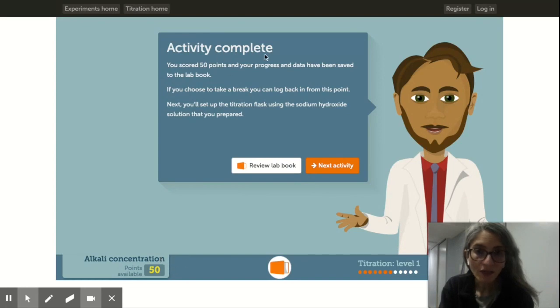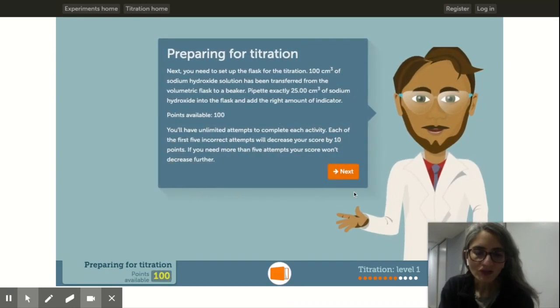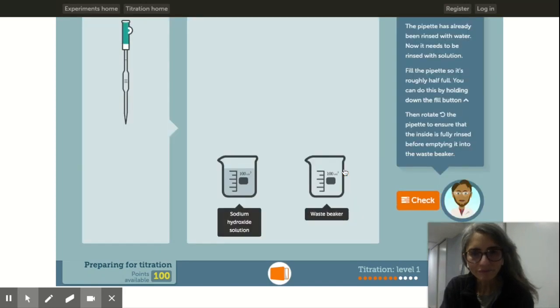And it says, okay, you're done. I mean, you did terrible, but you're done. And you're going to click through to the next activity, Preparing for the titration. Let's see what that entails. Now, here we go again, and we have to use some lab equipment to get some of this preparation done.